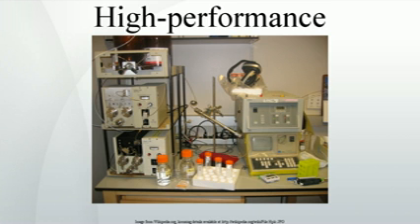For example, the addition of inorganic salts causes a moderate linear increase in the surface tension of aqueous solutions, circa 1.5 x 10^-7 joules per centimeter squared per mole for NaCl, 2.5 x 10^-7 joules per centimeter squared per mole for (NH4)2SO4, and because the entropy of the analyte solvent interface is controlled by surface tension, the addition of salts tends to increase the retention time. This technique is used for mild separation and recovery of proteins and protection of their biological activity in protein analysis, hydrophobic interaction chromatography, HIC.